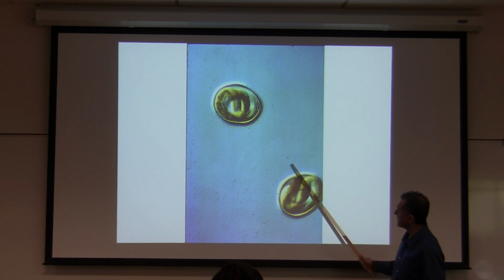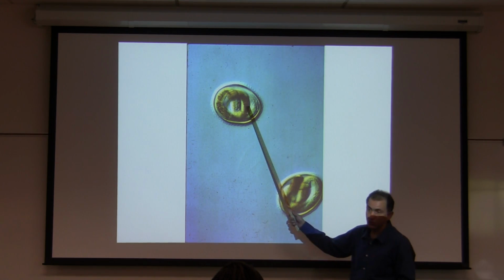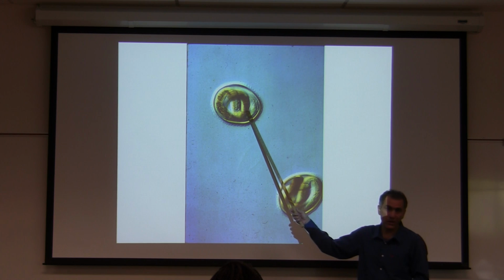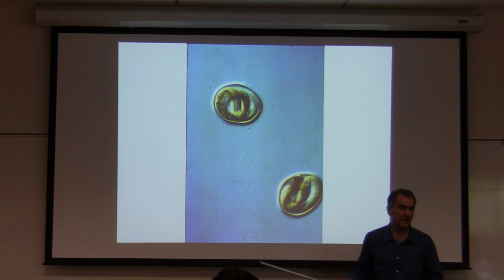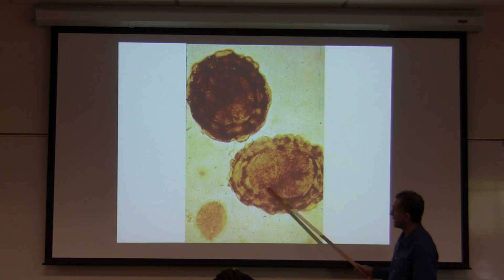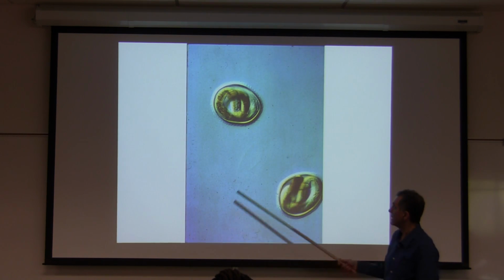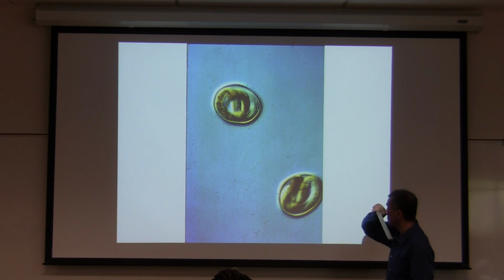Here they lost their thick shell. They've been in a moist environment, and larva is formed. So this is either L1, L2, or L3, ready to come out and infect someone. It could be any one of them, but they lost their thick shell. We put them in a moist dirt environment and kept it moist with water, and now they are ready.